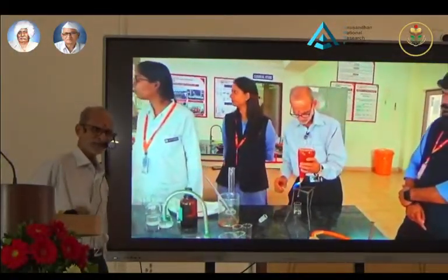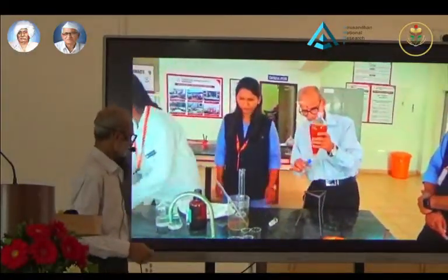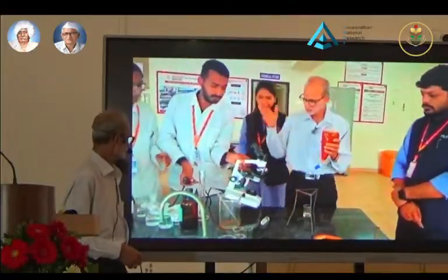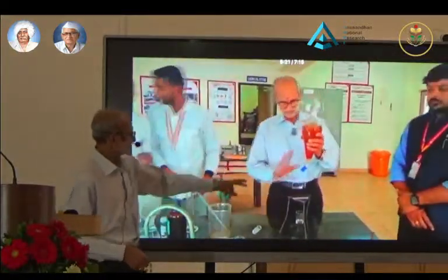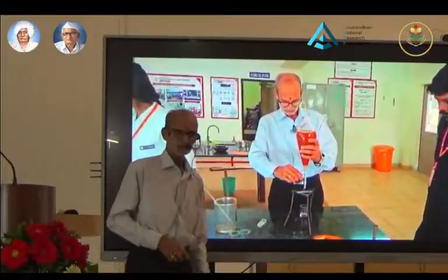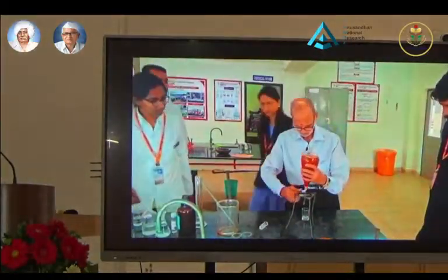Caffeine shows nice needle-shaped crystals under the microscope, and that is what follows next. A microscope is being arranged, and this is the dichloromethane layer. A couple of drops are put on the slide and allowed to dry. On drying, it has crystallized.